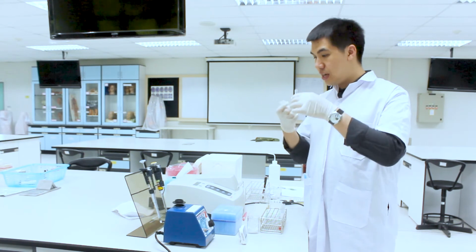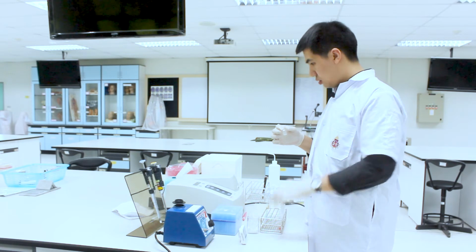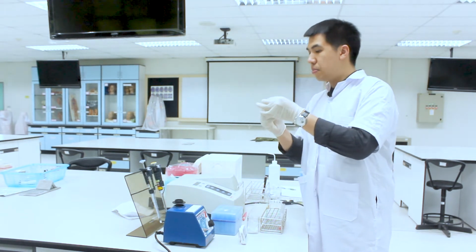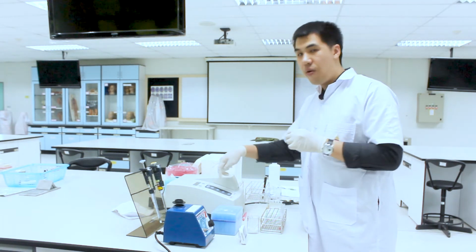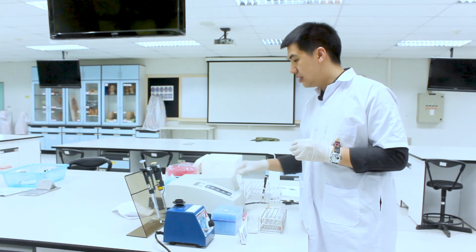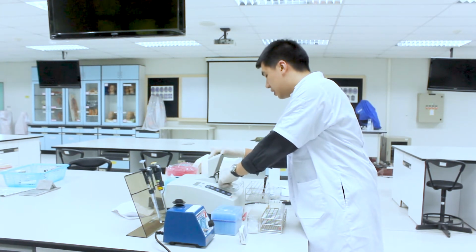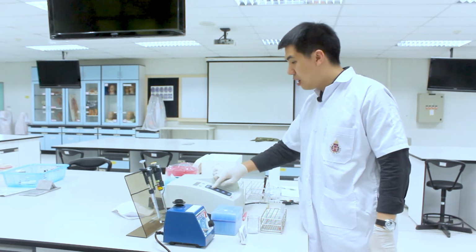So you just pour the solution directly into the cuvette. This is the blank solution. The maximum absorption wavelength is 500 nanometers, so I have already set the absorption at 500 nanometers. You insert your blank here and press zero absorbance.